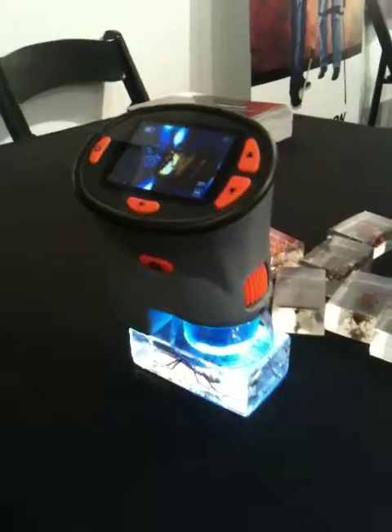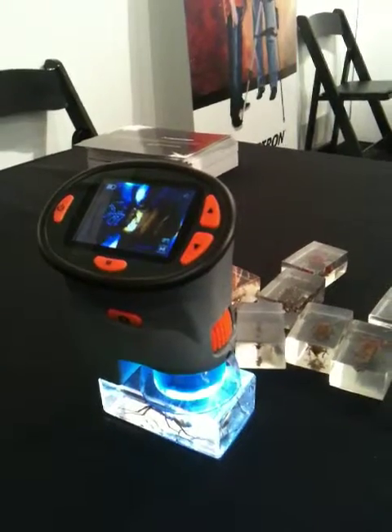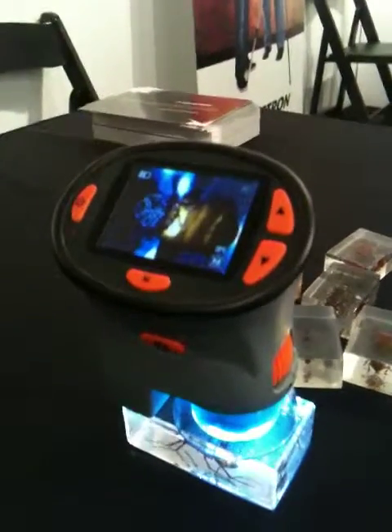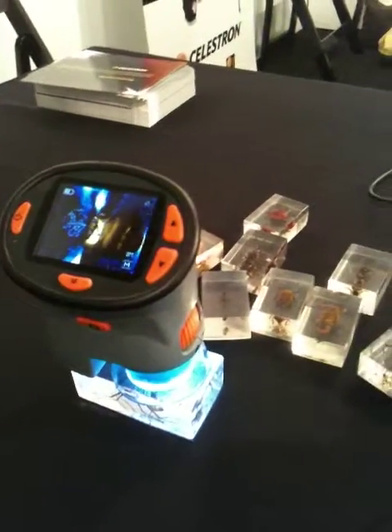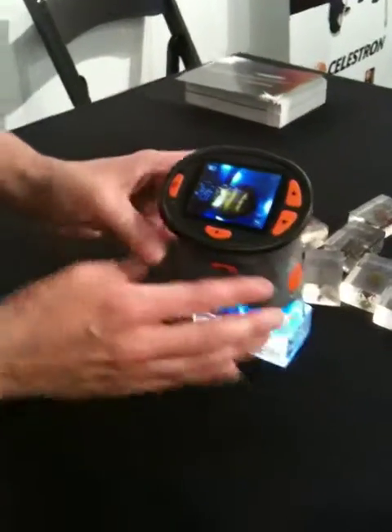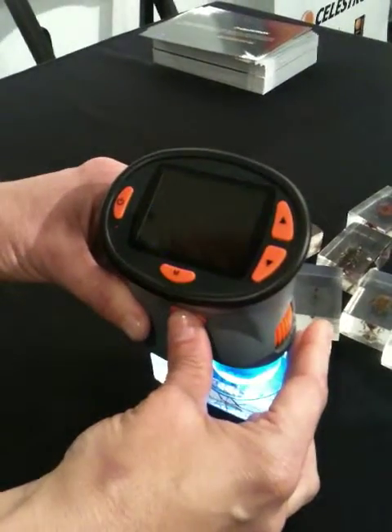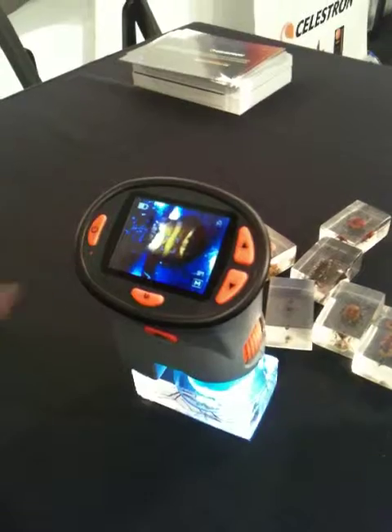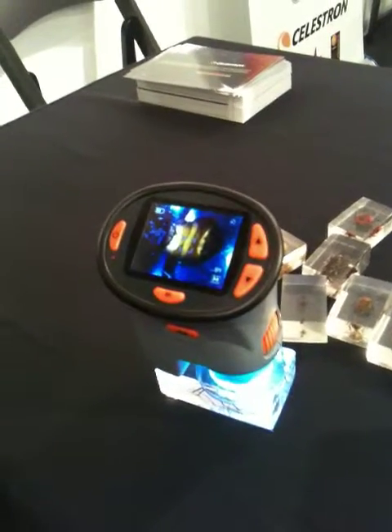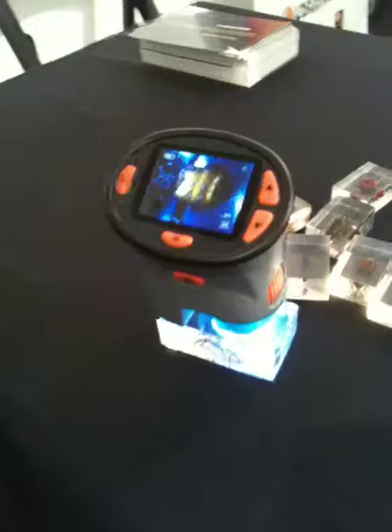We have our handheld LCD digital microscope here. We just started shipping this in March. It's a little handheld microscope, battery operated — two AA batteries. You can go from 10 times to 50 times zoom on this and 200 times digital zoom. It'll take snapshots and short video. You just basically put it over the object and then you can focus and snap a button here. The picture is automatically saved internally. It has 128 megabyte internal memory and it also has an SD card slot and a USB port so you can upload the pictures to your computer. Very convenient.